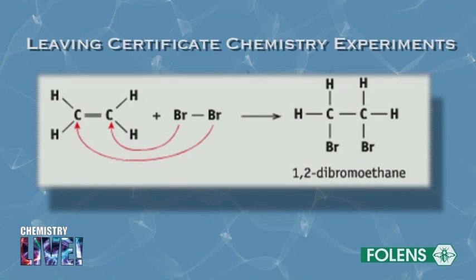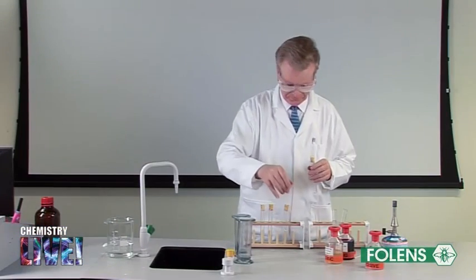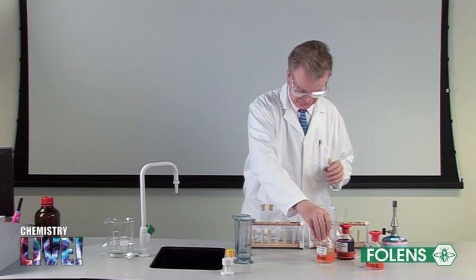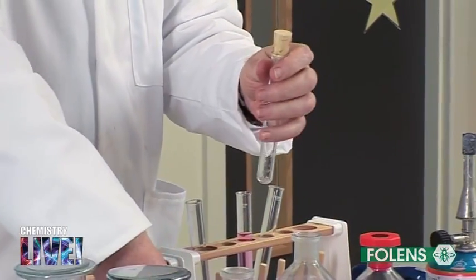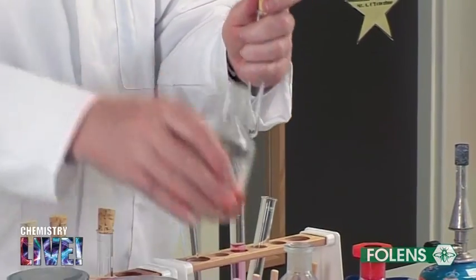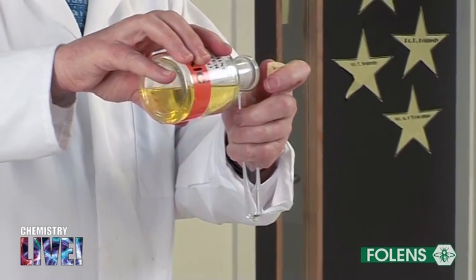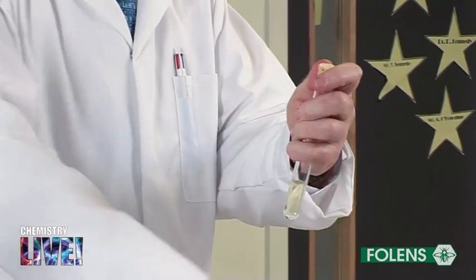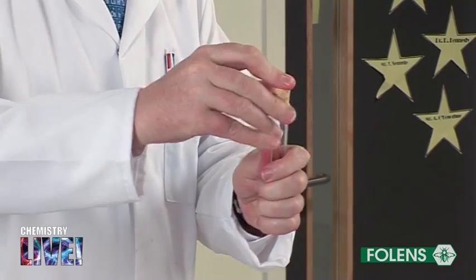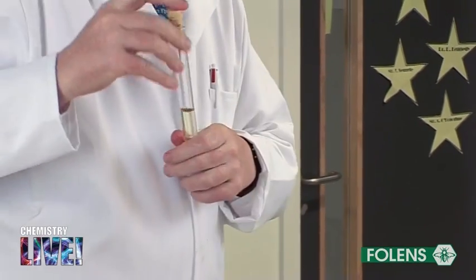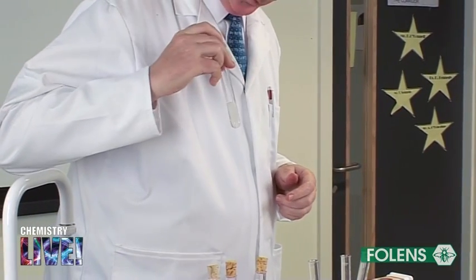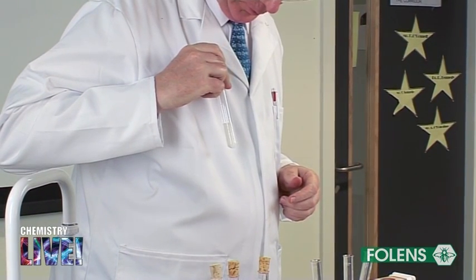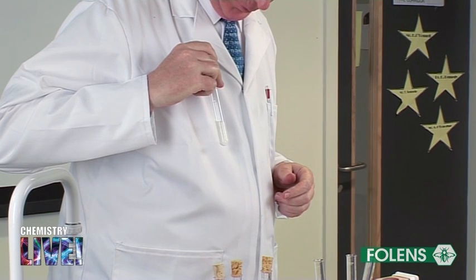A solution of bromine in water is commonly called bromine water. Let's see what happens if we add some bromine water to a test tube of ethene. Replace the stopper and shake the test tube a few times. Note that the yellow color of the bromine water solution disappears.